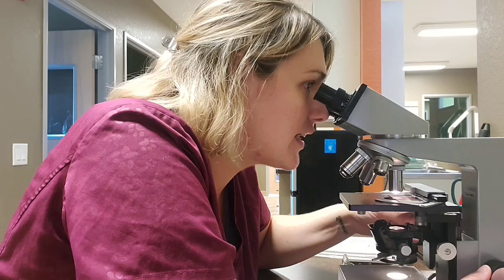Yeah, so I don't really see anything on here. As far as I can see, it is negative. But that is how you perform a direct smear or direct drop heartworm test.